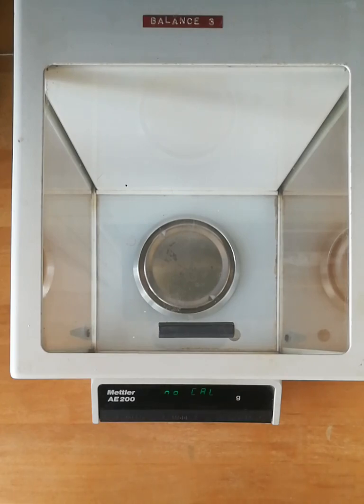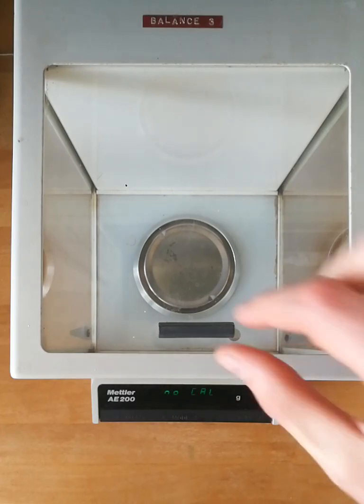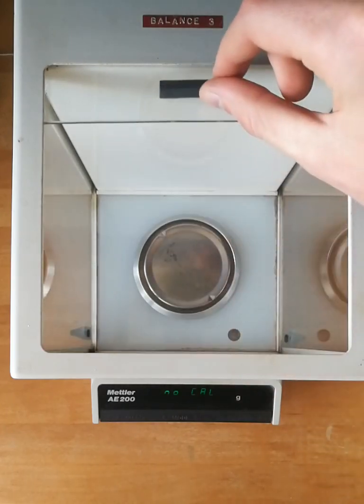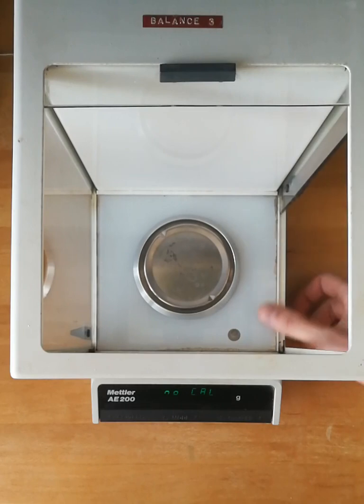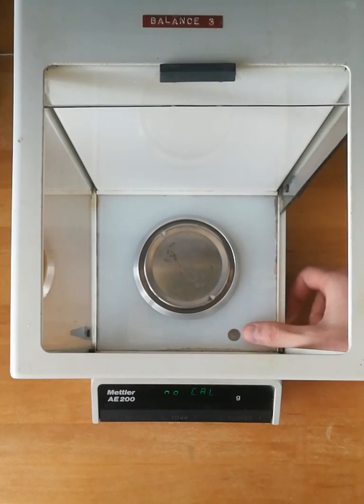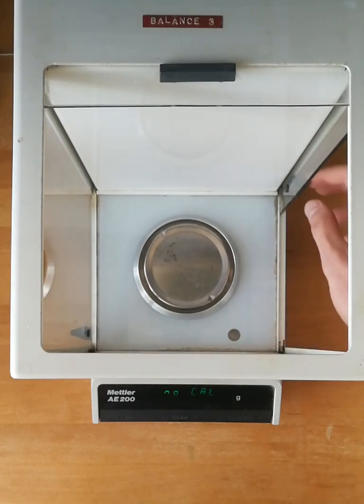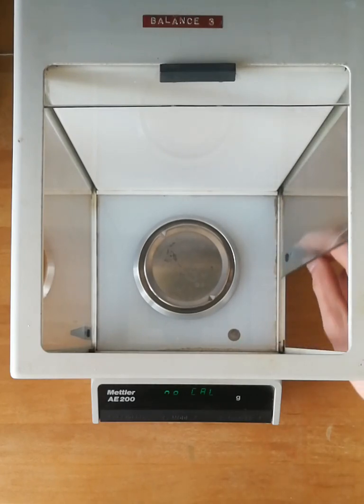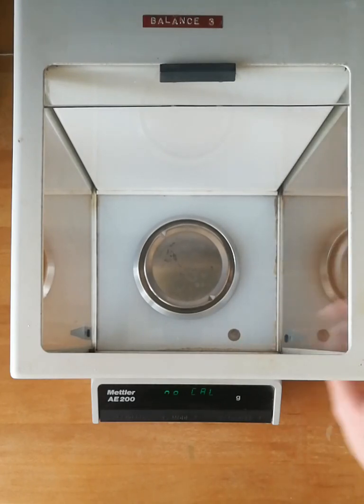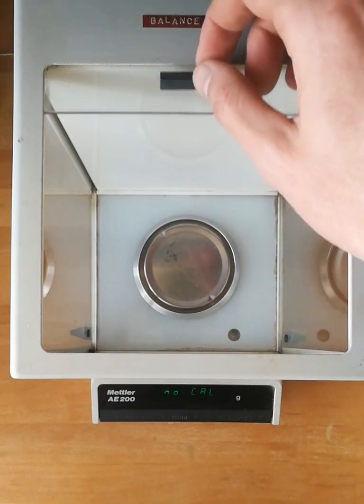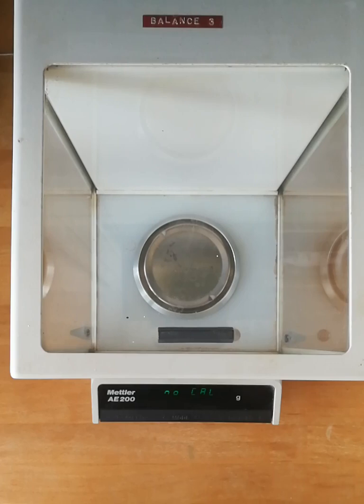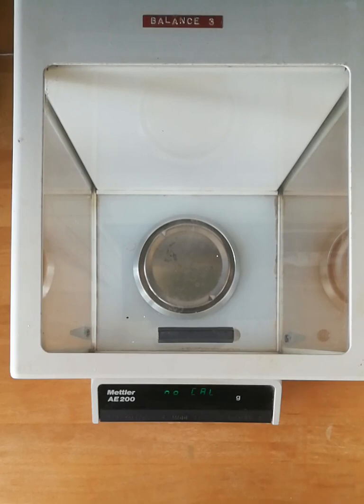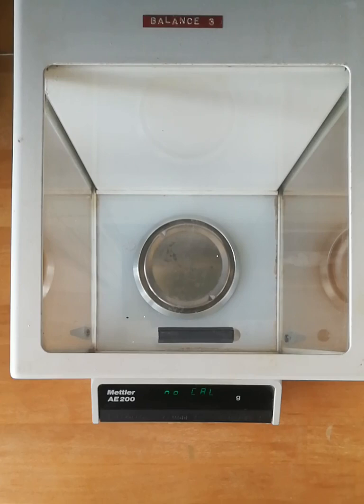Before we do the calibration, we need to make sure that the internal bullseye displays that the balance is on a level surface, and it absolutely needs to be on a rock solid stable surface. Otherwise, vibrations from environmental causes can make the display fluctuate and have a surprisingly significant effect on whether it's able to get a stable reading.